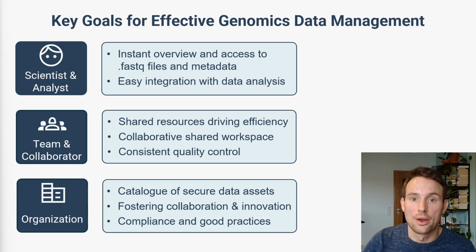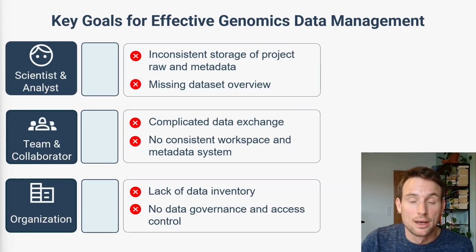And then from an organizational perspective, there is the requirement to actually catalog data assets systematically and in a compliant manner, and also foster the collaboration between individual research teams in order to drive future innovation and, for instance, product development. However, in practice, there are still a lot of bottlenecks in managing NGS datasets.